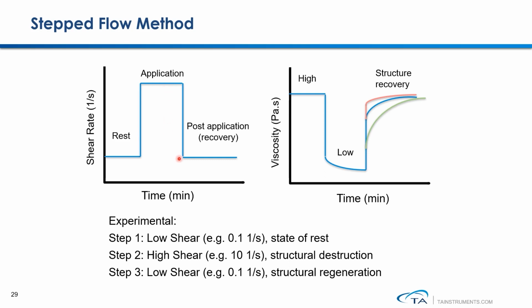In step number 3, the measurement jumps back to low shear again. The recovery of the sample's viscosity is monitored as a function of time. This third step is to measure the thixotropic recovery.